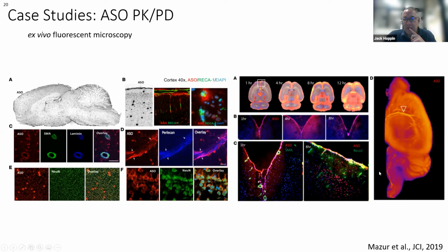So here's an array of different stainings, as well as an understanding of where the drug was, systemically administered, co-localized with these other cells. The imaging scientist in my case, you've covered now from femtoliter, from the subcellular all the way through 4-dimensional distribution of the drug. You have incredible control over where the drug is as a function of time and location in this model for both cohorts.